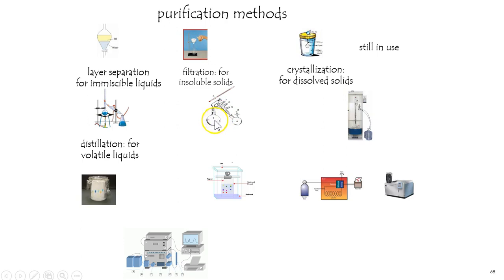And I think it would help if we identified each part of this distillation apparatus. We begin with number one, which is the pot. You put your mixture in there. Typically you spin it. Part number two would be the distillation column, which is particularly short because this is known as a short path distillation apparatus.